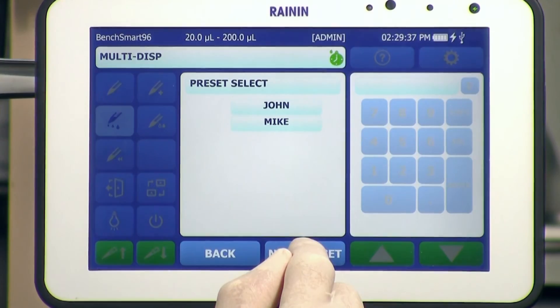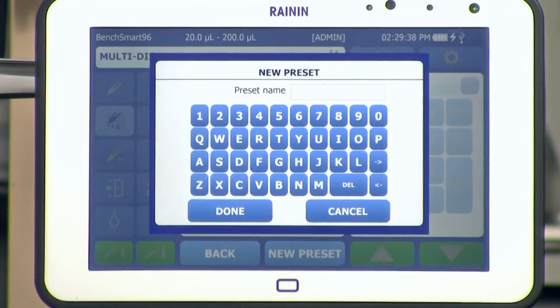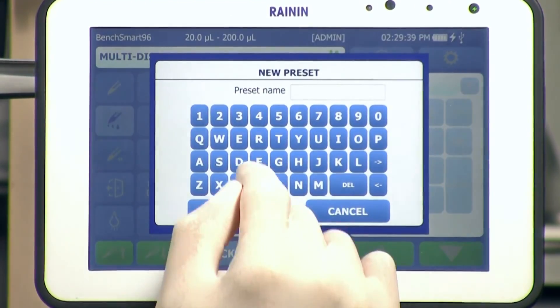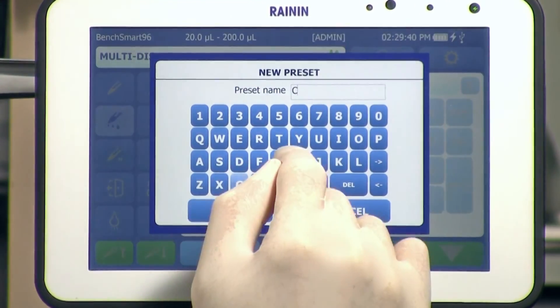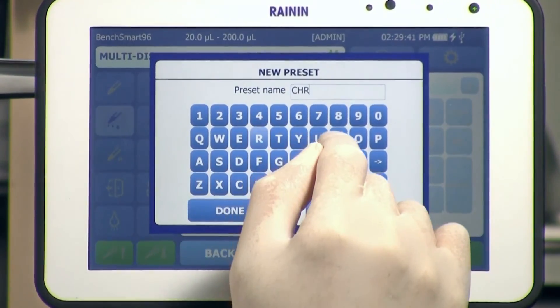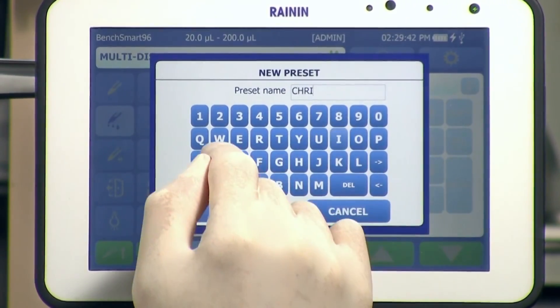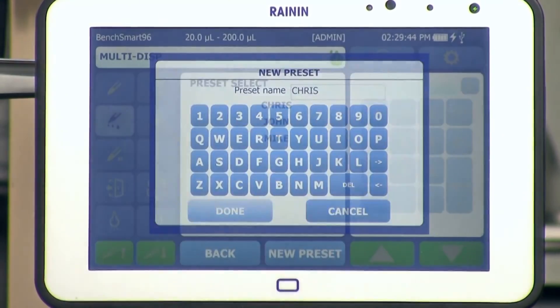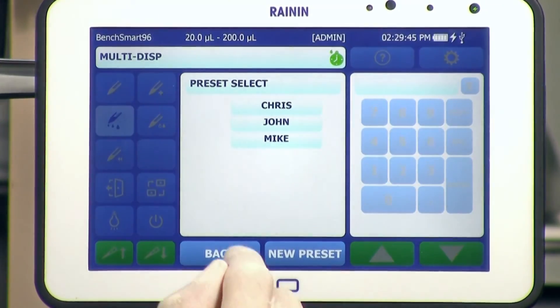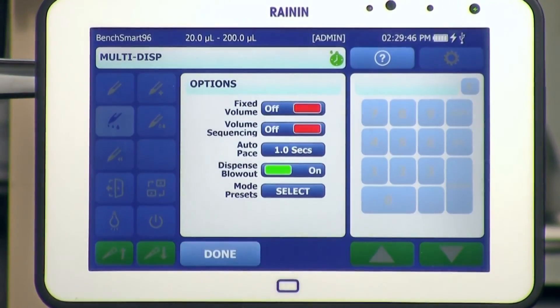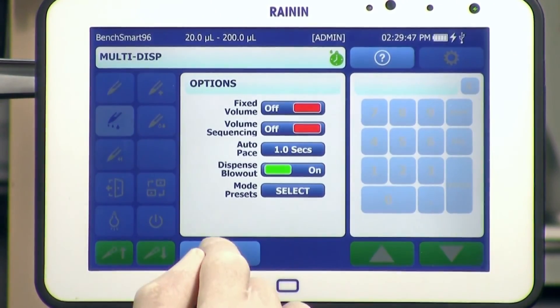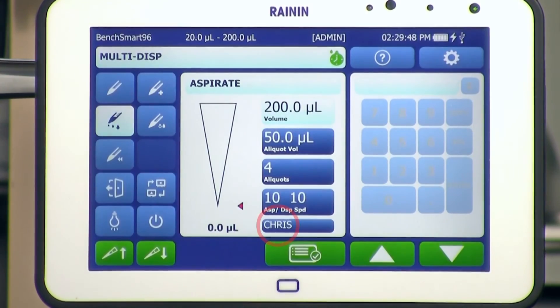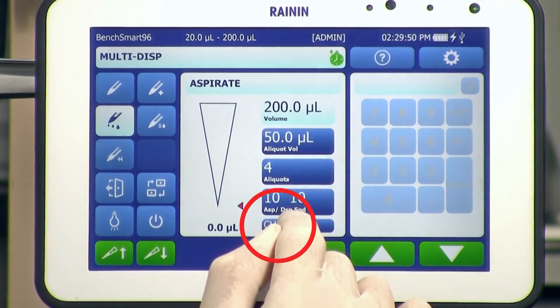At the bottom, tap New Preset, then type the preset name and tap Done. To access this mode preset again, just tap the Preset button at the bottom of the center section of the touch screen.